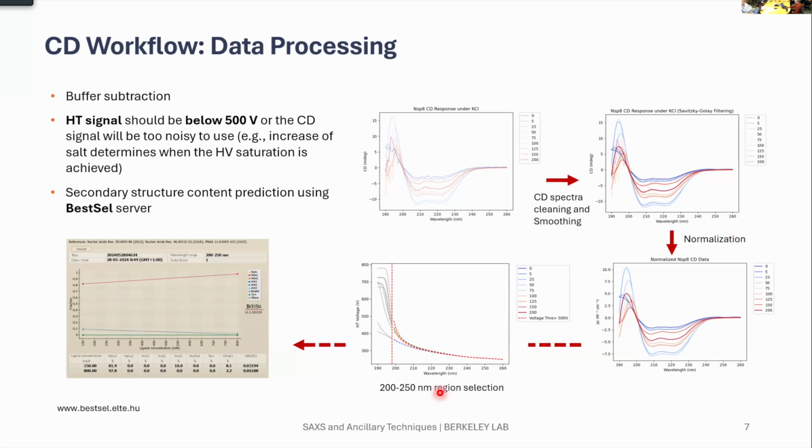And like I mentioned before, some components can give us very significant noise. Here is the result for a range of potassium chloride concentrations in millimolar.